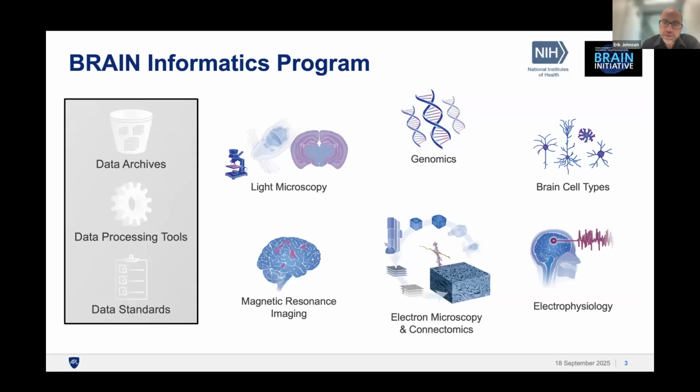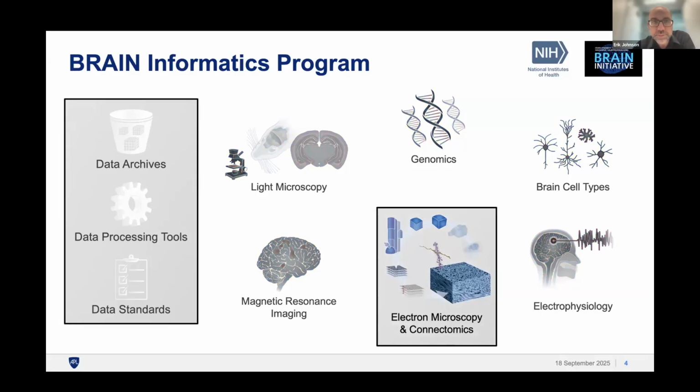So with our BossDB team, like I said, we focus on this electron microscopy connectomics domain, and we have built this archive that's specialized within the context of this field to enable large-scale neuroscience studies, but has a lot of lessons potentially applicable to the storage and processing of volume EM samples throughout a lot of different domains.